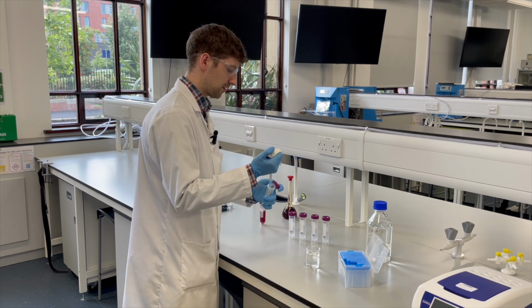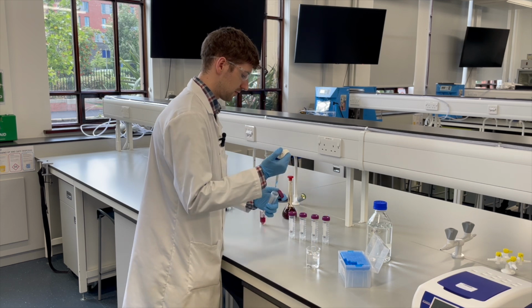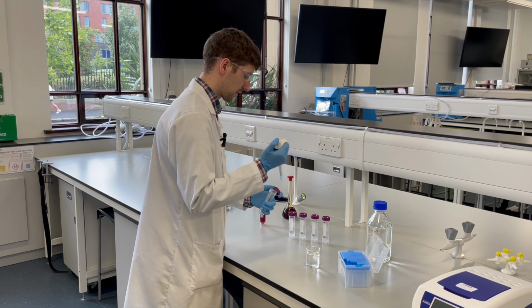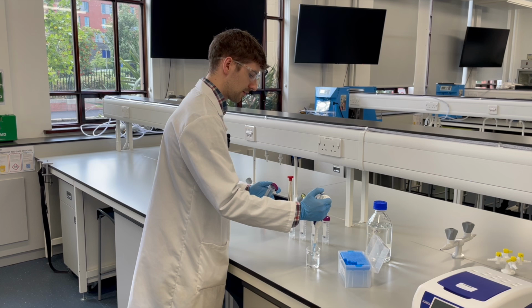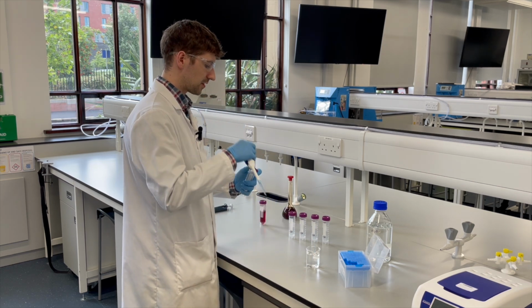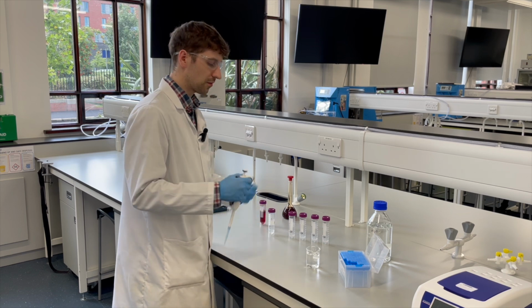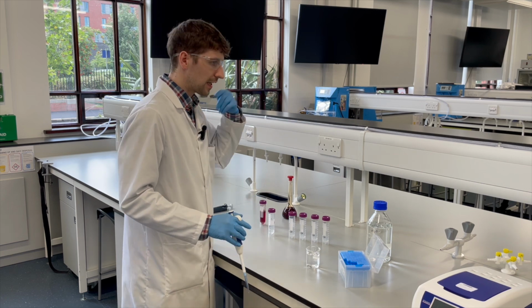Placing it into the solution. 1, 2, 3, and 4. And you'll notice that I count them out aloud because sometimes you forget, okay? Humans make mistakes. It's good to count things aloud. It'll keep you on track.